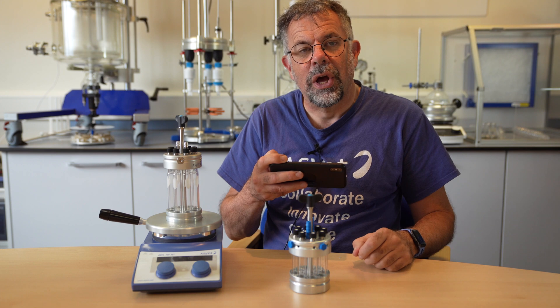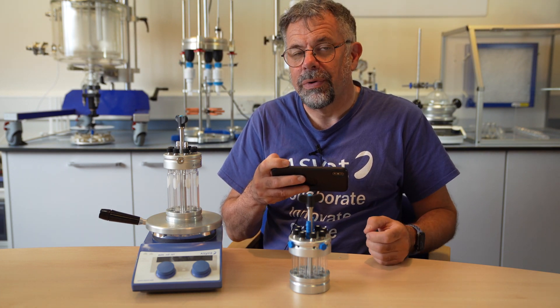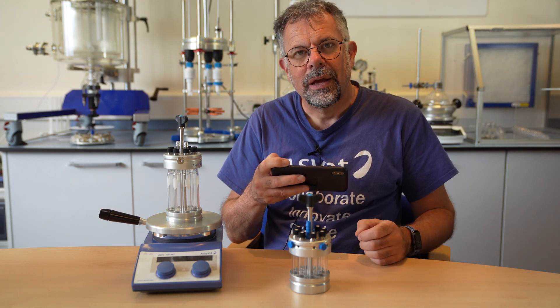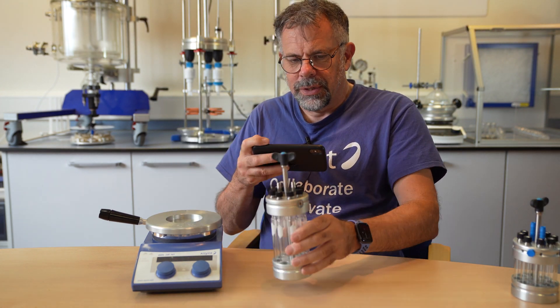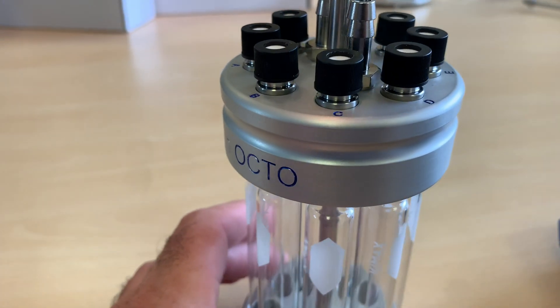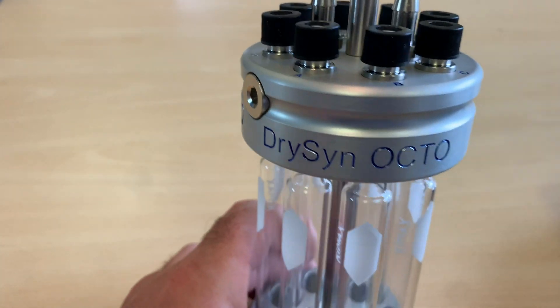So we worked hard with our engineers and came up with a new design that aesthetically is so much better — and the good news is no more cost. Here's the new one. With the Octo Mark II, immediately you can see the sideways pathways that we had to drill from the side have gone.